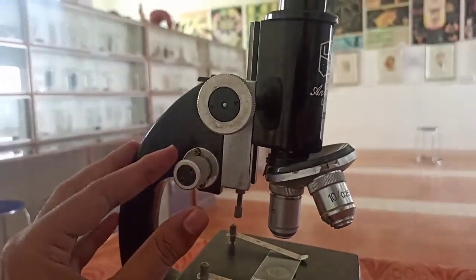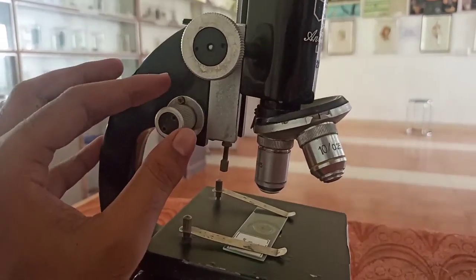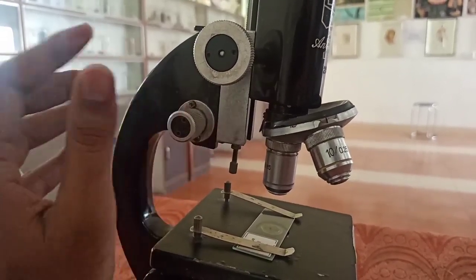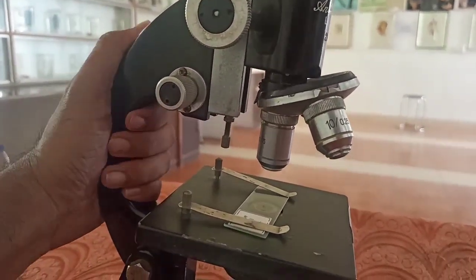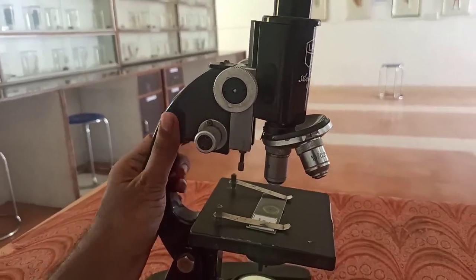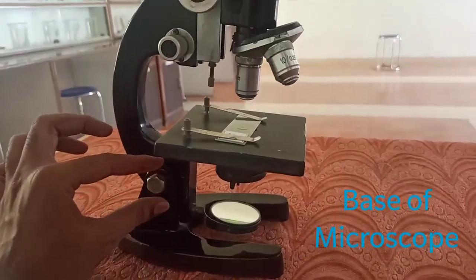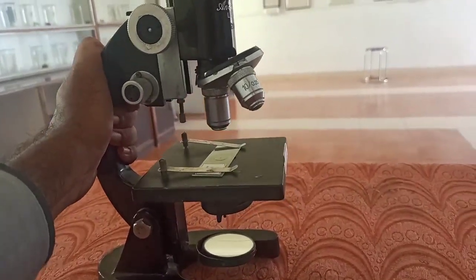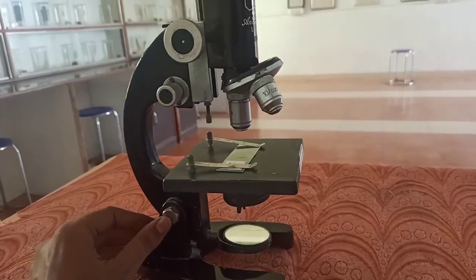There is also a coarse adjustment. And there are different visions for different people, so for fine focusing there is a fine adjustment screw. This is called the base of the microscope. And this is the inclination screw.